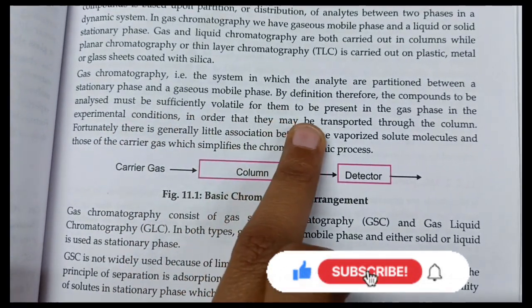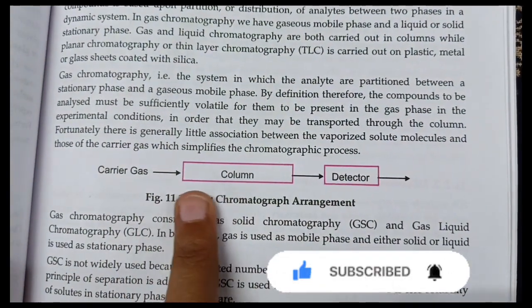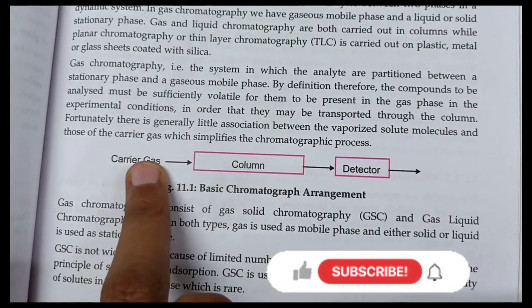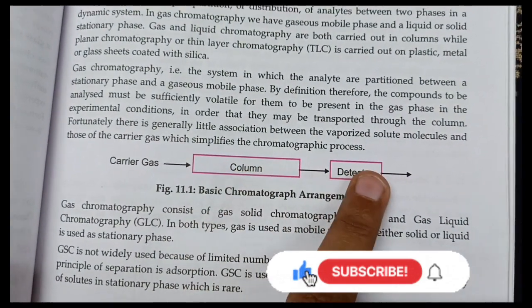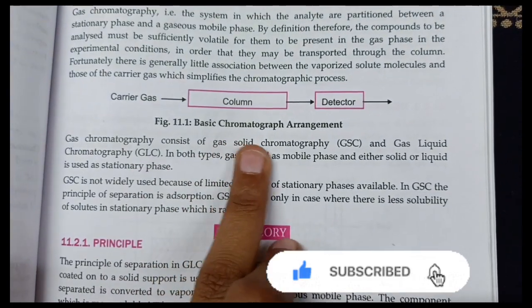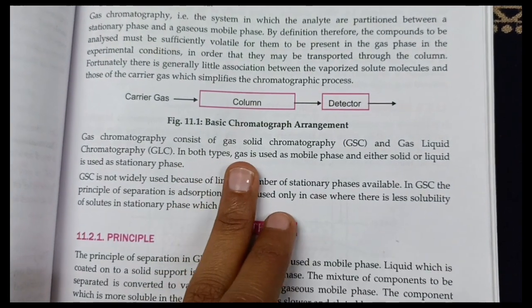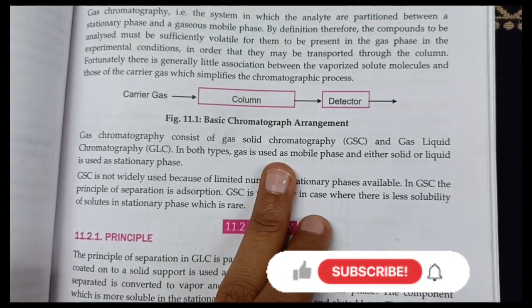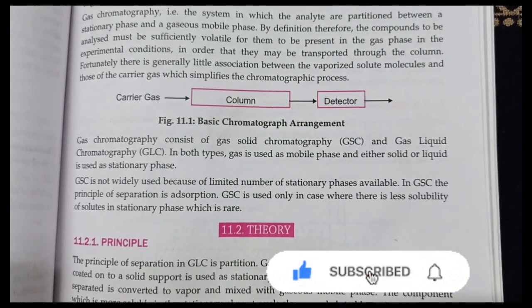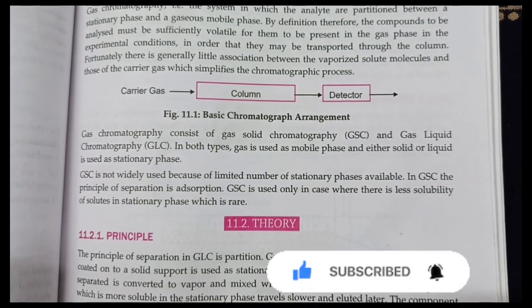In order that they can be transported through the column, gas chromatography is basically arranged as carrier gas, then column, then detector, then analyzer. Gas chromatography consists of gas solid chromatography and gas liquid chromatography. In both types, gas is used as the mobile phase, and either a solid or a liquid is used as a stationary phase. Gas solid chromatography is not widely used because of its limited number of stationary phases available.